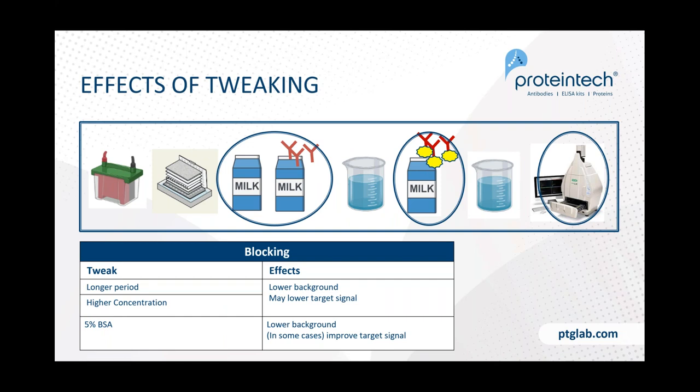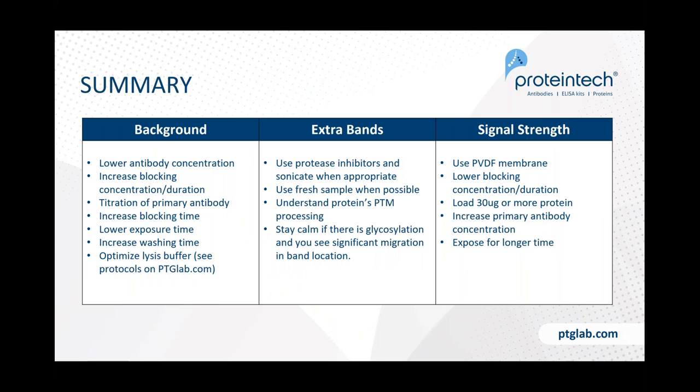For blocking, a longer blocking period — such as overnight — or a higher milk concentration up to 7% may help lower background. However, if you go too high you may also reduce your target signal, so keep that in mind. We recommend milk for most situations, but 5% BSA can sometimes help for probing certain proteins. BSA is strongly recommended if you're looking at a phospho-epitope, as it is better at blocking non-specific interactions and avoids accidentally stripping the phosphate group off — so BSA is the recommended blocker for phospho-specific proteins.